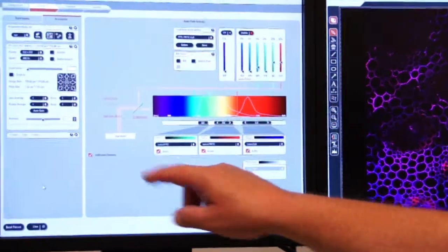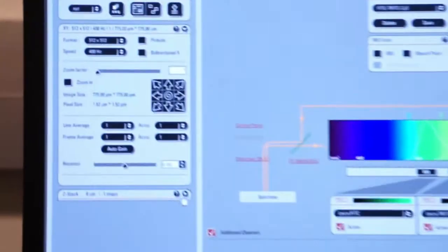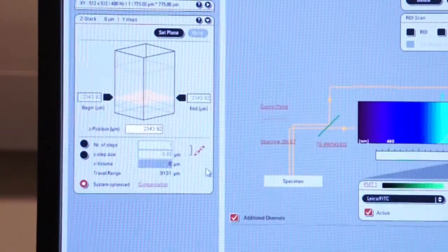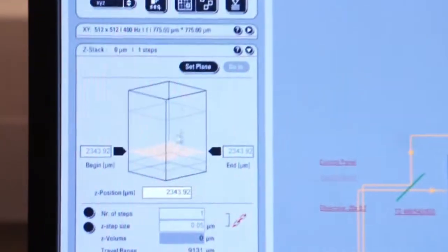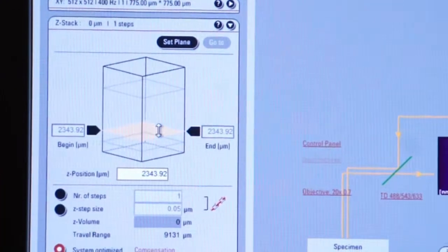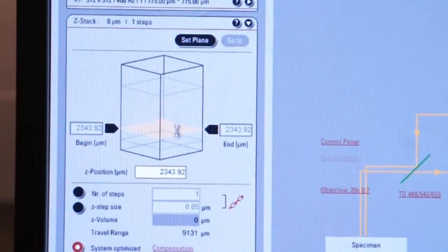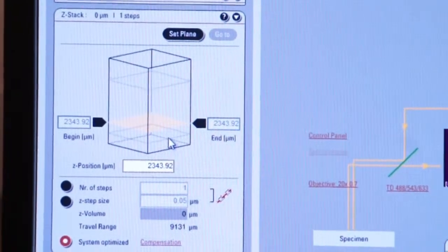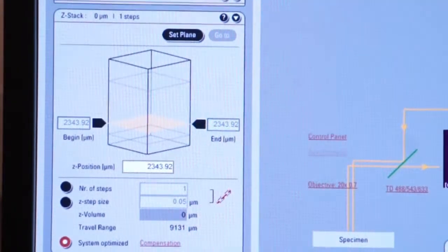To do this, we want to click on the Z-Stack tab. So we click on Z-Stack, and now it returns this volume that shows us where we're going to set our beginning and end points. We'll focus over here on the screen. We'll go live, so you see a live image. Let's initiate the composite image.